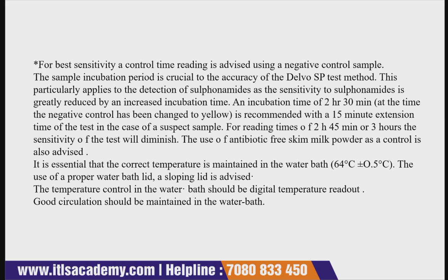Why? Because sometimes the temperature fluctuates. If the water bath temperature is not properly maintained, or if the wells are not properly sealed, there are chances of an inappropriate result. So for the best result, the precautions a person should take are that the well should firstly be properly sterilized.